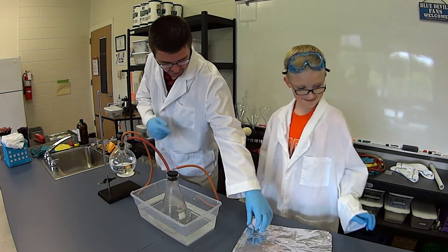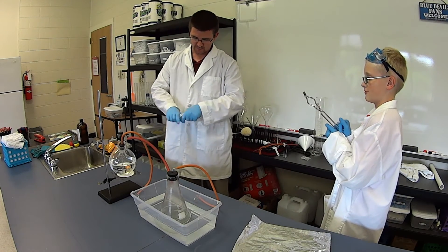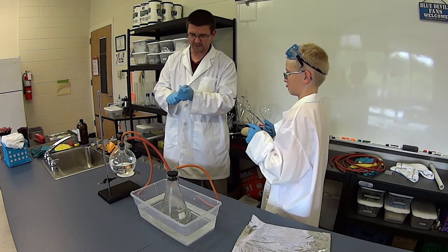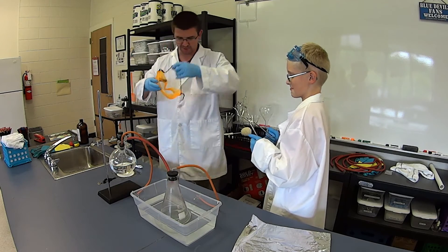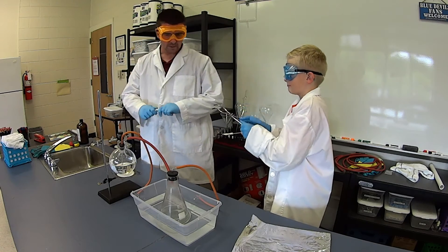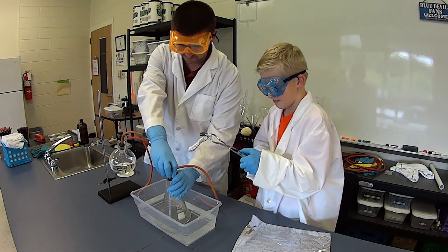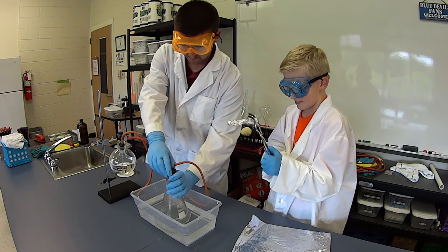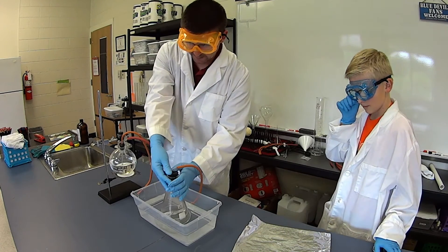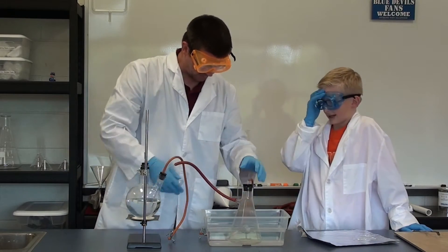I'm going to get one of these sheets. If you can get those beaker tongs there, I'm just going to fold this up with some aluminum foil here, and I'm going to have you place that in shortly. Let's get our safety goggles on first. When I pull the top off of this, you're just going to drop that down into the beaker. And we'll put the cap back on.